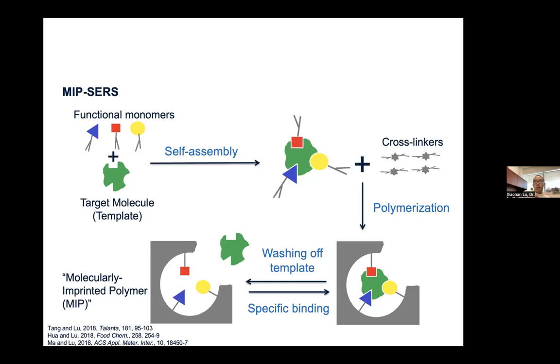So I introduced surface enhanced Raman, but we have another challenge. The challenge is when we use SERS to analyze or detect the analyte within very complicated sample matrices, especially food, because we know in food there are a lot of components, a lot of macromolecules such as proteins, lipids, polysaccharides, nucleic acids, etc. All of those macromolecules within the food matrices will unfortunately contribute to the Raman scattering signals. It is highly likely that the contribution of Raman spectral features from the food residues, from the food components, will mask the Raman or SERS signals from the targeted analyte.